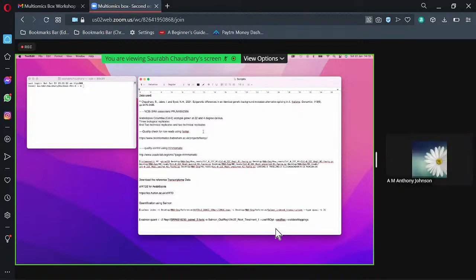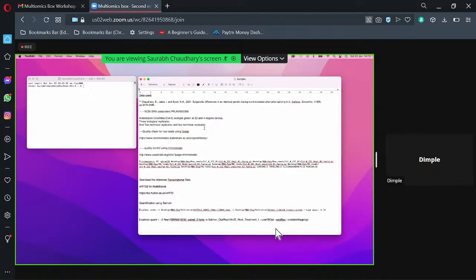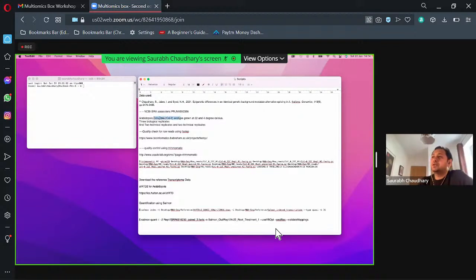Okay. Yeah, thank you. So right now there are 44 data sets. I put this as accession. I told you, we are not going to use all. We are going to use only the Columbia. It has methylome data and nucleosome data in this paper. So we are going to use only the RNA-seq data of Col0. You don't need that, actually. I'm just telling you the difference between the data, that it's 22 degree and 4 degree. I'm using that data.